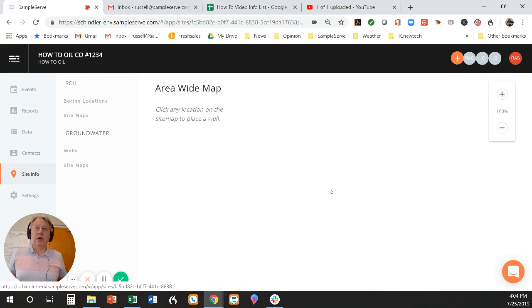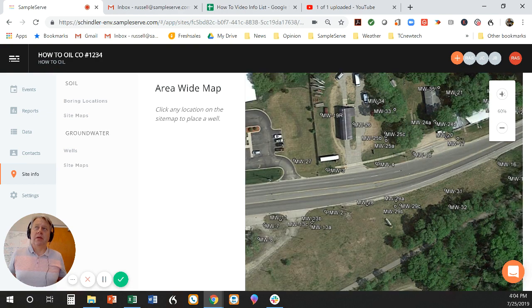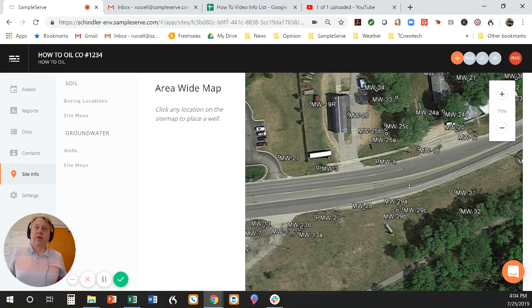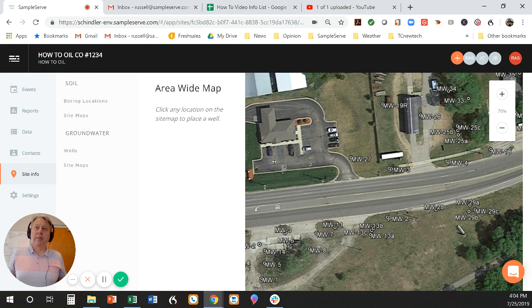I'm just going to click on the map. It's going to pull up my map. I can zoom in and out by clicking this, and I can drag around just by holding down my mouse and dragging.